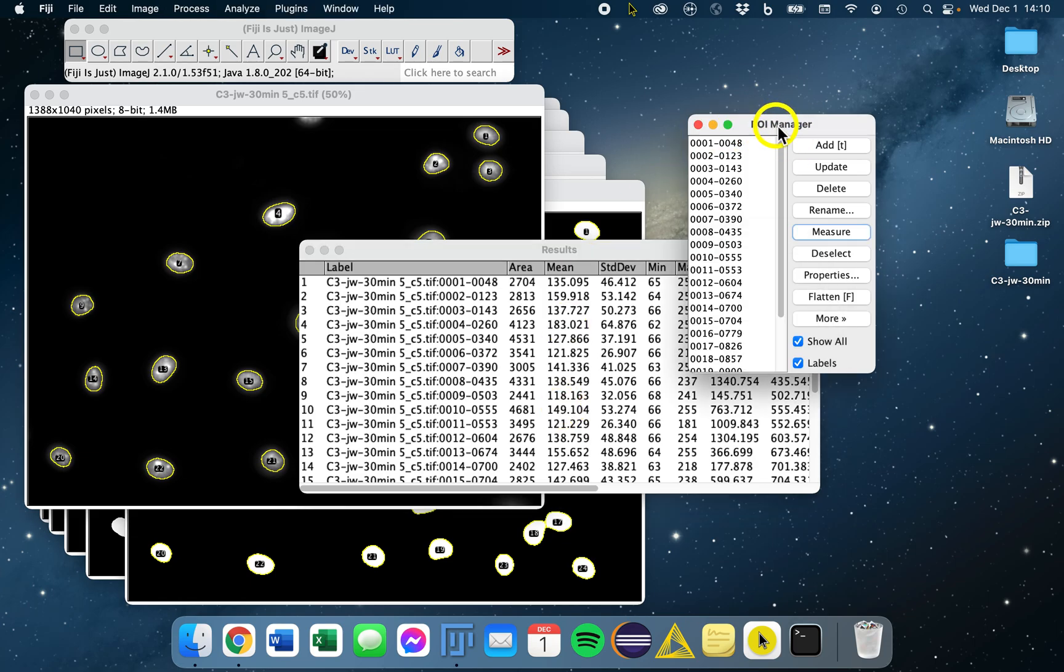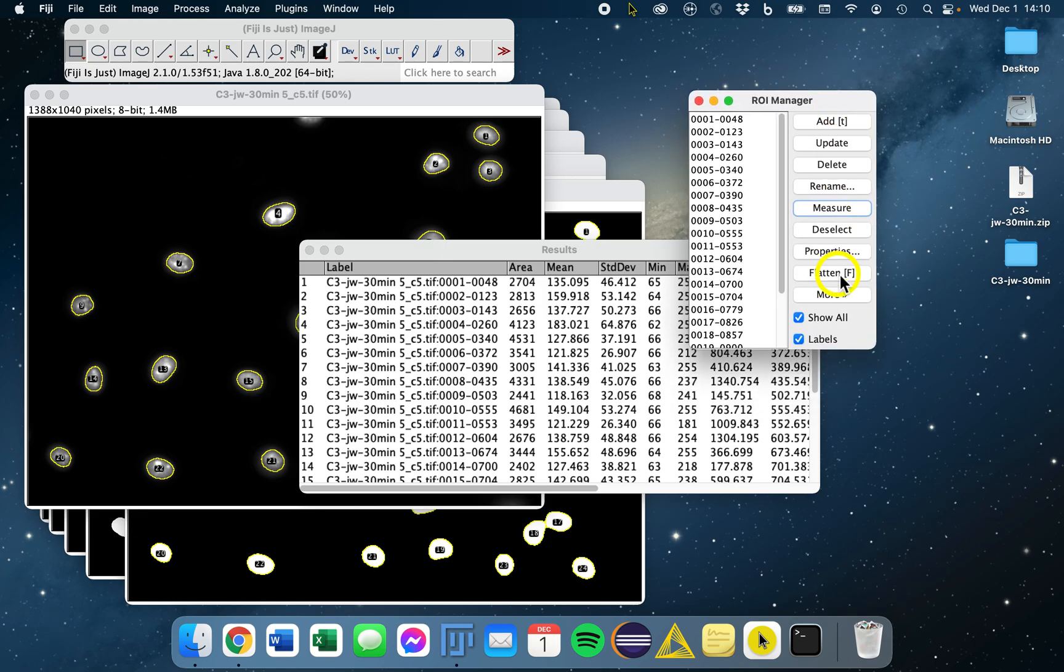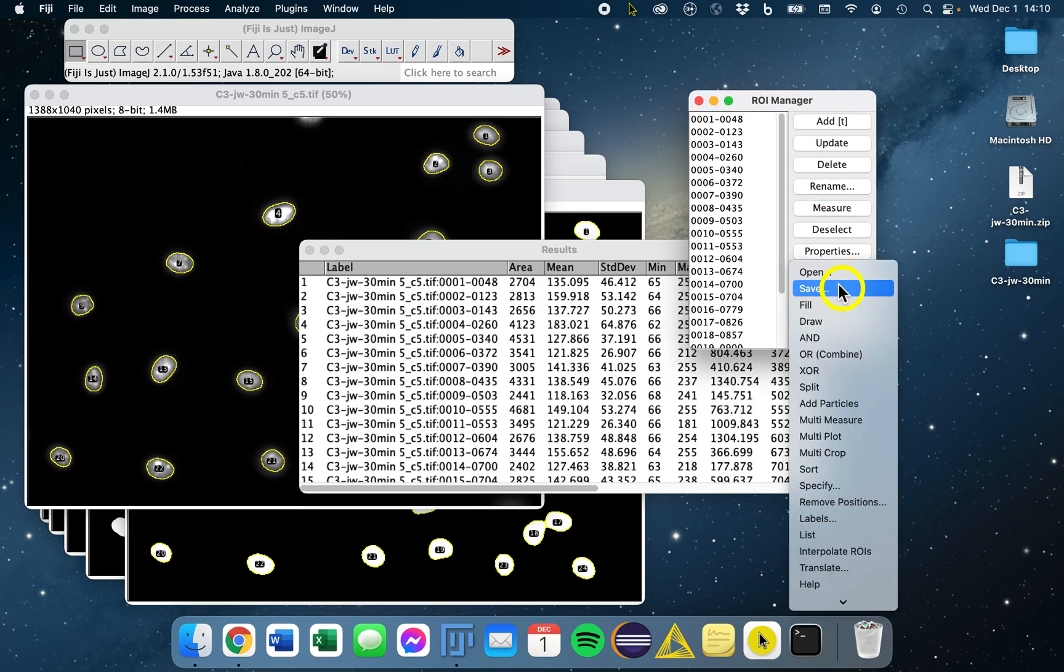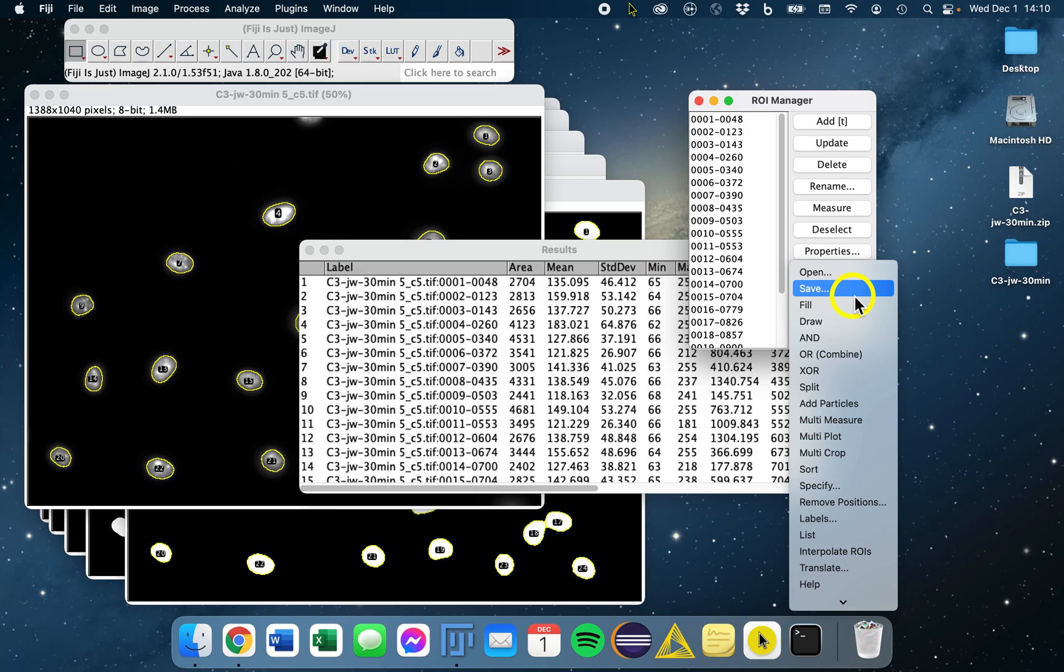I recommend too that you save your ROIs for each individual images. They can be saved as zip files. If you just go to More and Save As, you can actually see that you can save and open those zip files here. I always recommend saving this zip file when you are batch processing using a script. That way you can go back to any image and have a look at those ROIs. Happy measuring!